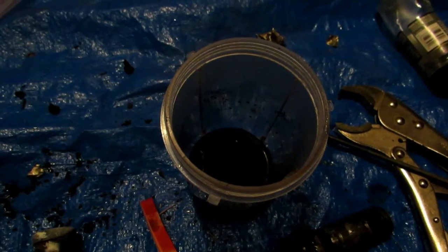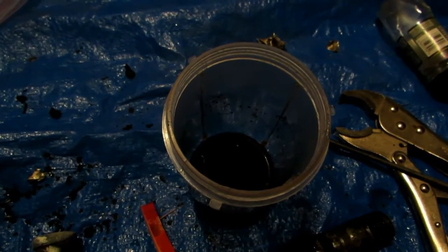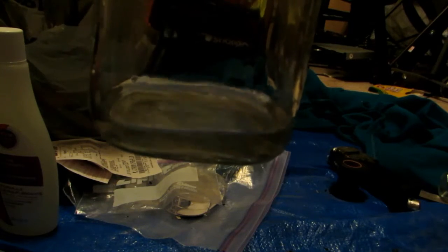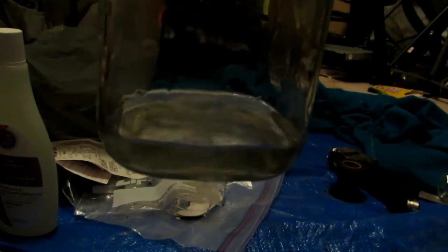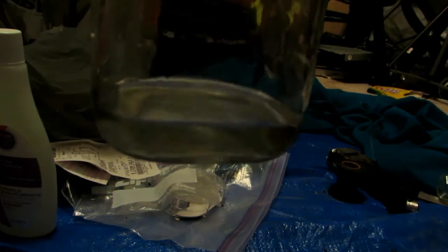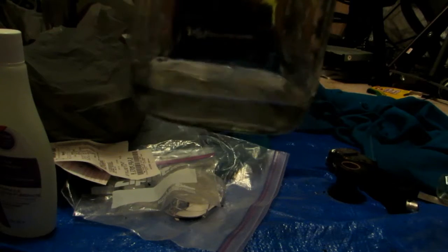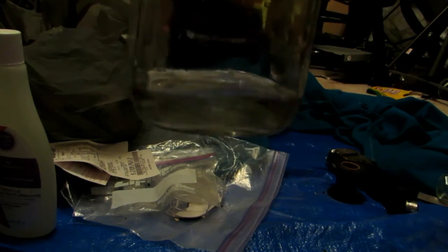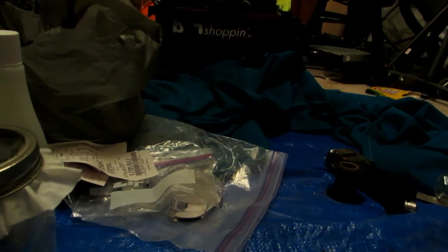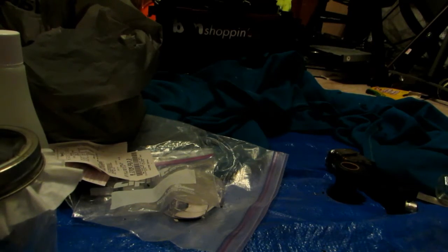We're filtering the solution right now, and the filtrate coming through is absolutely 100% clear, which means everything collected on the filter is elemental carbon. This is amazing, because the solution should now mostly contain potassium carbonate — hopefully 100% pure potassium carbonate. I'll let this filter through completely, then we can test it and boil it down to obtain a nice white powder.